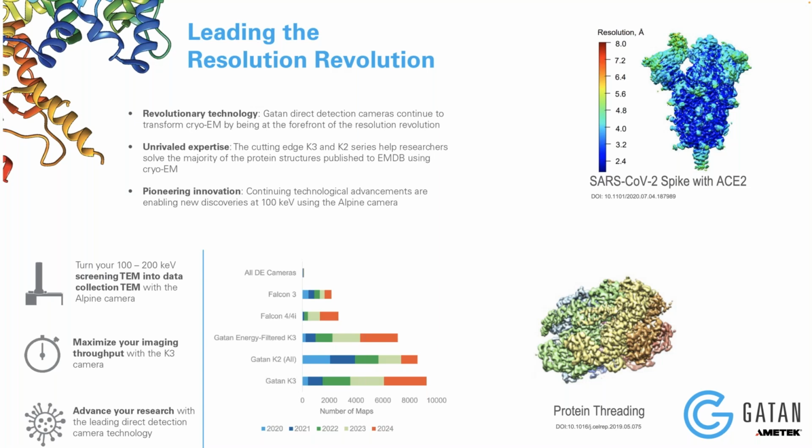These direct detection counting cameras have made a paradigm shift in cryo-EM. And the number of structures solved using these cameras and this methodology is growing with time. This is a nice little plot at the bottom, showing the number of maps or structures solved and submitted to the online EMDB database. You can see that with time, 2020, 21, 22, 23, 24, the number of structures being solved with these Gatan counting cameras is exploding.